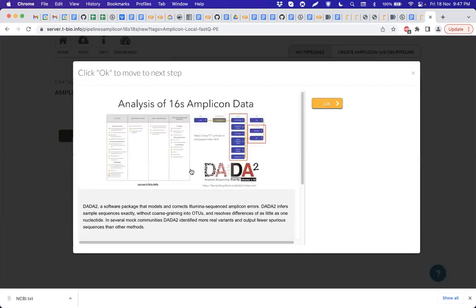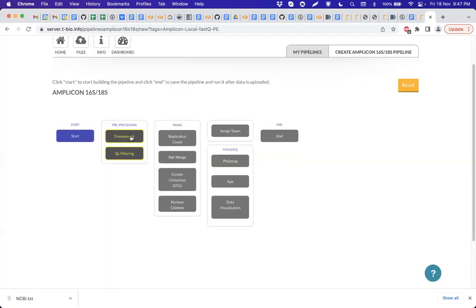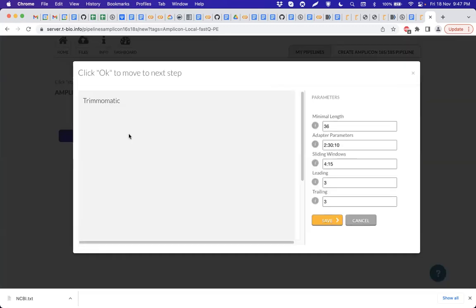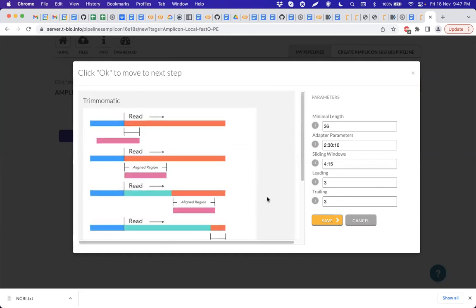What do we do? Right. Starting this doesn't do anything; it performs some quality checking, quality control, and everything, and then we can filter and trim using Trim-O-Matic and filtering. So this is very useful, for example, to examine the quality of the reads, right? We can trim this, and do we have to change the minimum length here, Sonalika? That's not here, no?